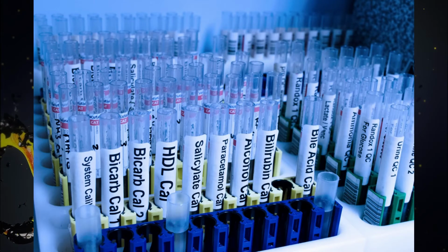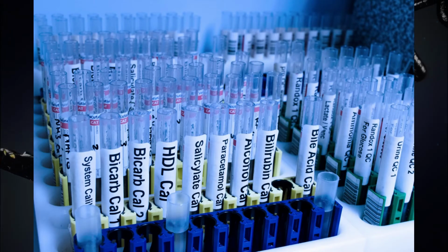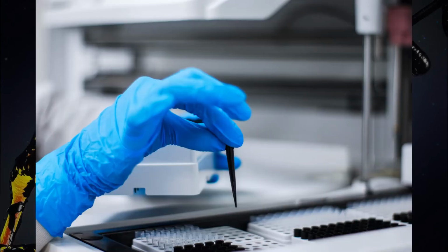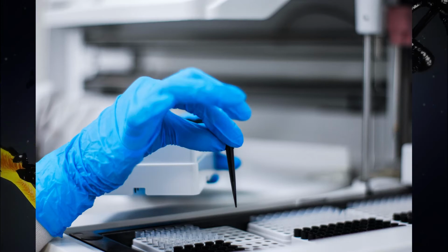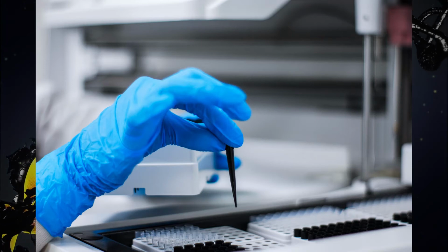The catch with this is that you have to know what you are looking for. That is, you need to be familiar with the target sequences of where the primers have to go to be active. Unlike the others, where you can have some degree of leeway in designing the primer, or you might be looking for what's in the genome, this needs to be well understood and established before you go in.